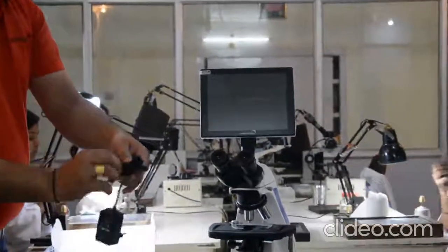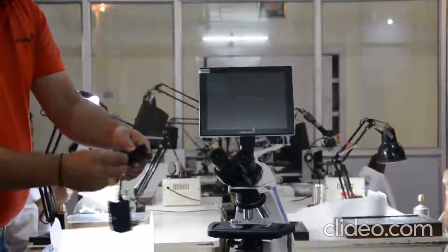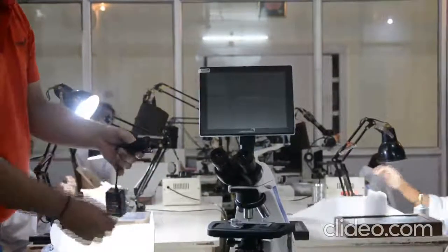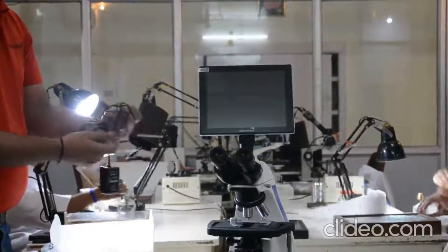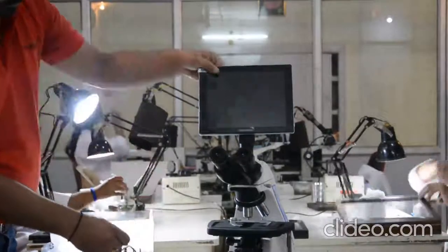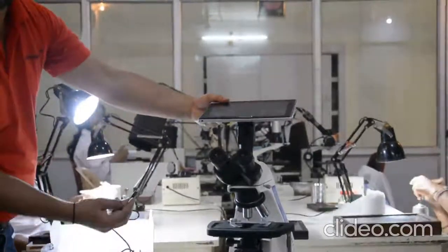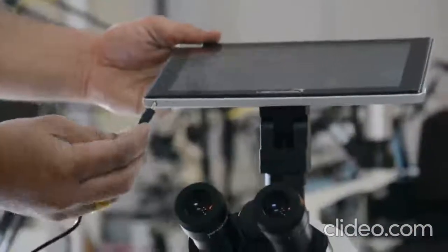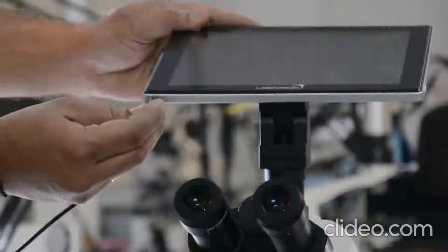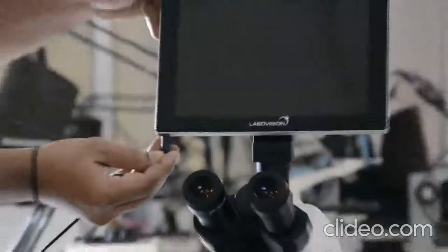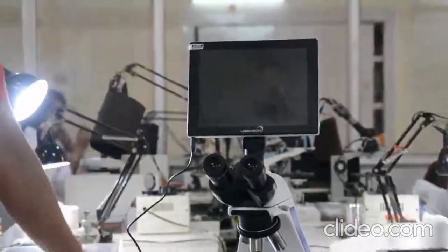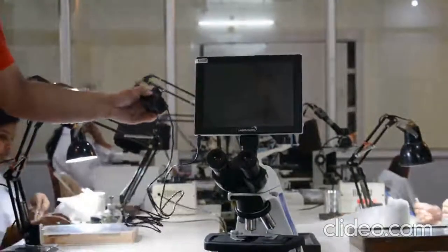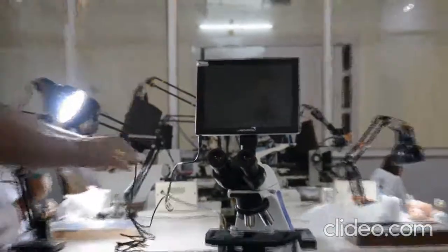We will put the power cord of the LCD screen. There is a slot which is mentioned. Yeah, this is the slot. We have to put the box in it. And you put the power cord in the socket.